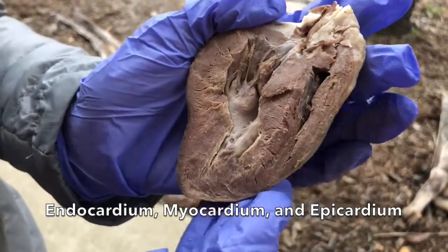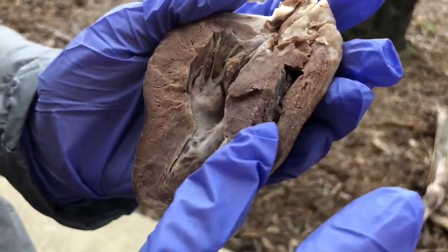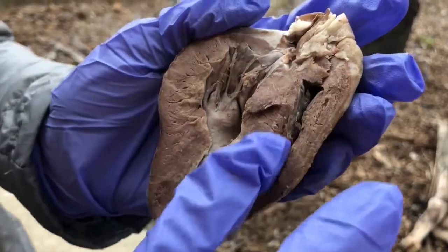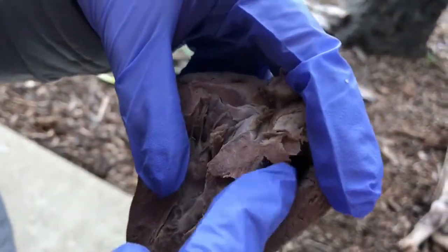So here we have the epicardium, which is on the outside of the heart. Next we have the myocardium, which makes up the majority of the middle of the muscle tissue inside the heart. And finally we have the endocardium, which is the inside of the heart.